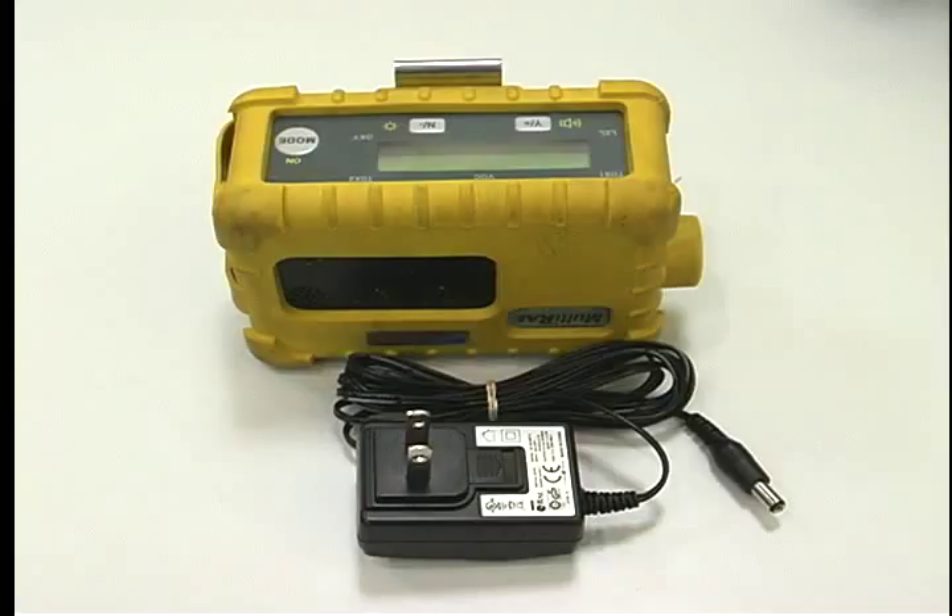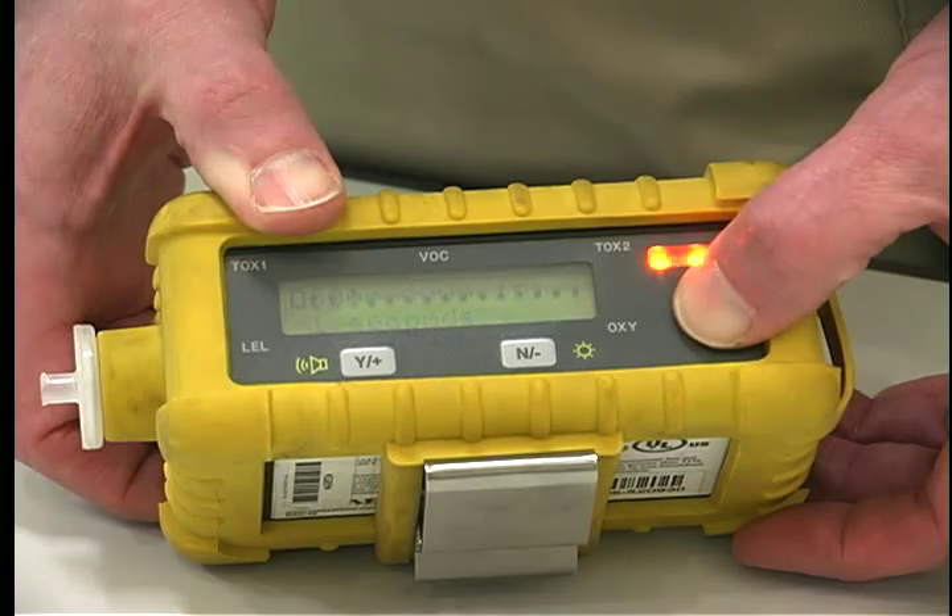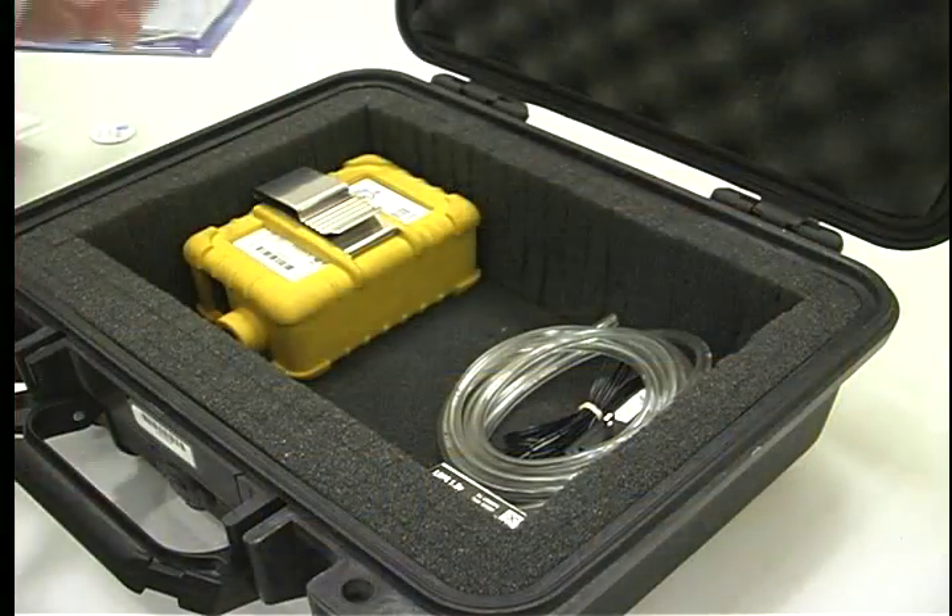If requested, the unit can run on AC — Galson will send an AC adapter and a rechargeable battery. To end the survey, push and hold the on/mode button for five seconds to turn the unit off.